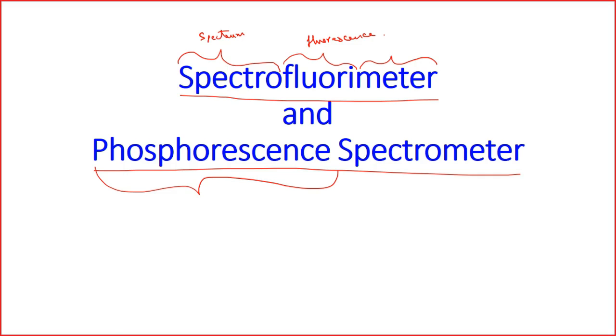And talking about this UV illuminator, in the previous class I showed you how you can do image-based analysis for the UV-visible spectrophotometer.